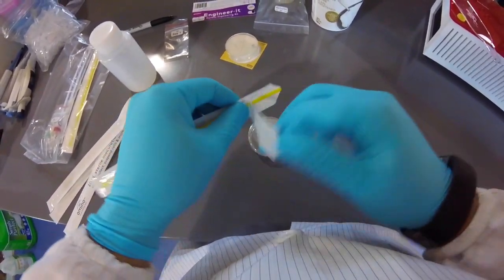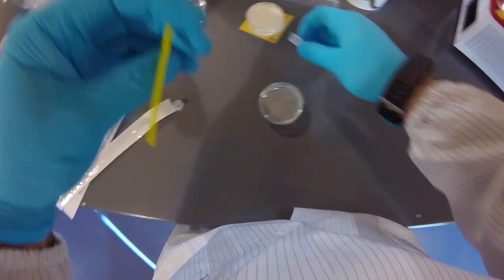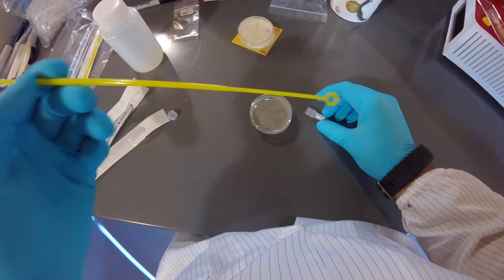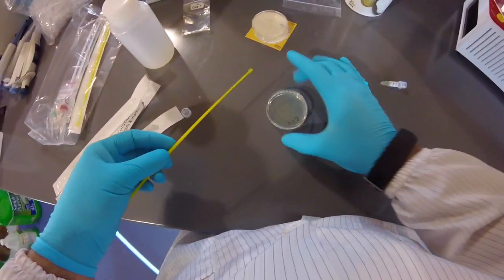So I'm going to take a single loop for this. We're not trying to get colonies or anything. We're simply trying to see whether the cells will grow on this or not. So you're going to, again, dip it in here, make sure it's wet. I even got a little bit of agar on it that time, which is fine, but it doesn't matter.